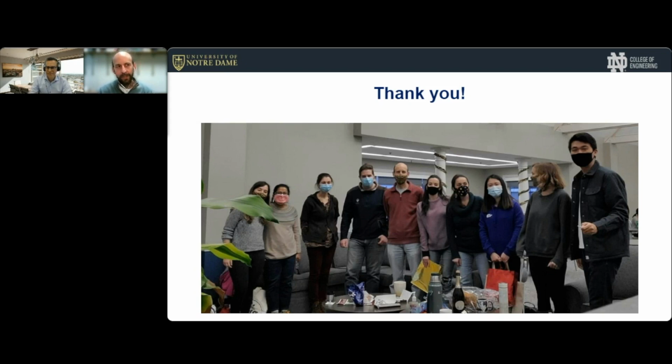But I don't think so. When we did experiments with pure cultures without protozoa, we didn't see these voids form. So it's interesting with scale. With scale, it might be more challenging to see into the scale layer. If it's a very dense layer and if it's optically opaque, the voids could be an artifact of the OCT not being able to penetrate beyond the scale layer. But I'm just guessing that. I don't know. Maybe it is something that's correct.